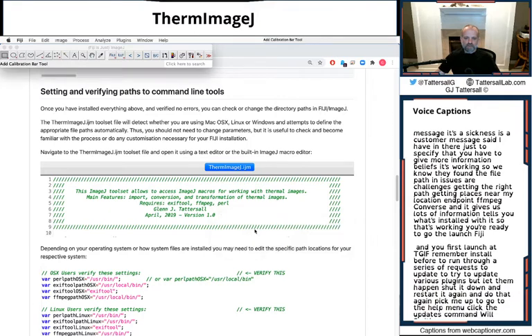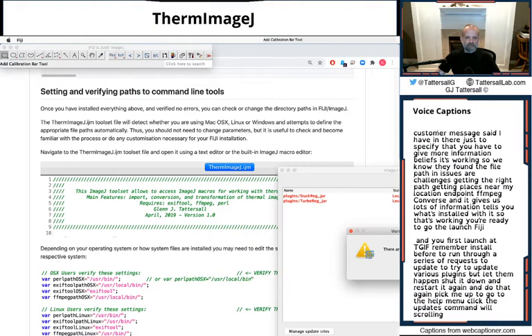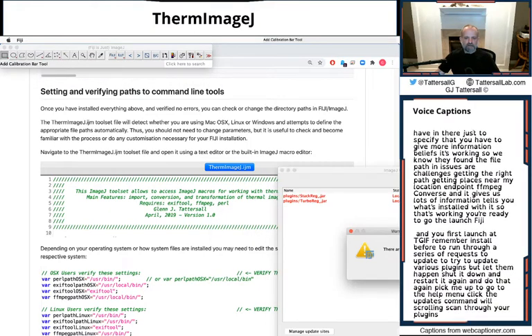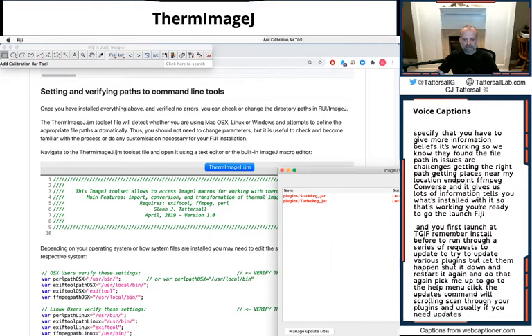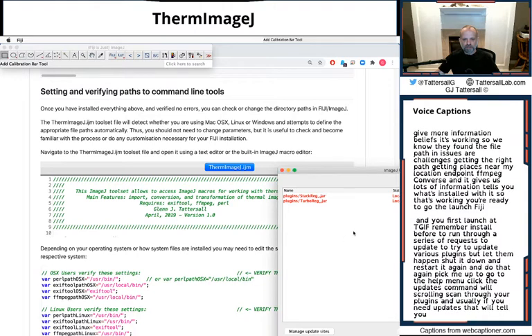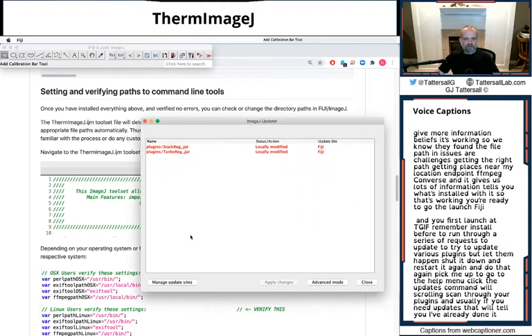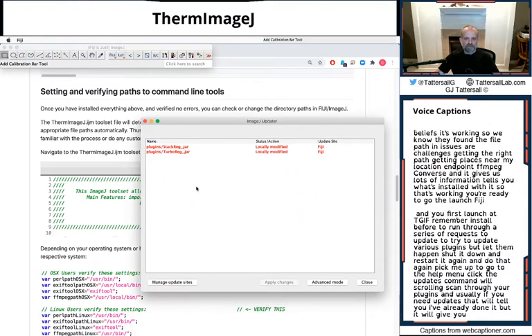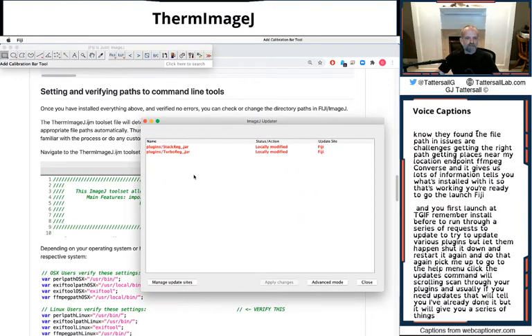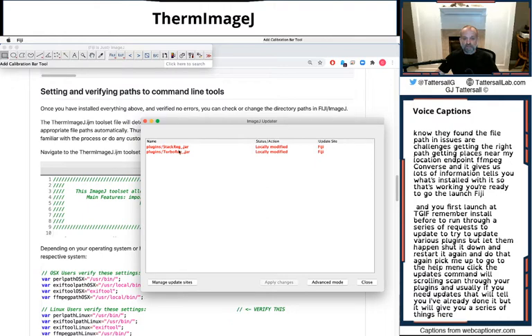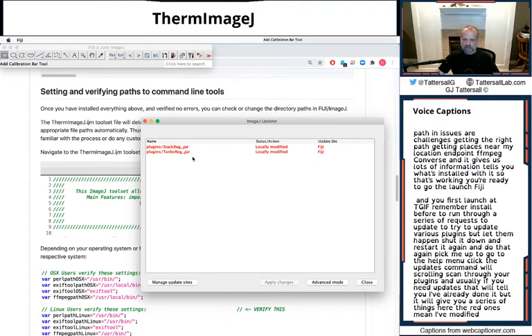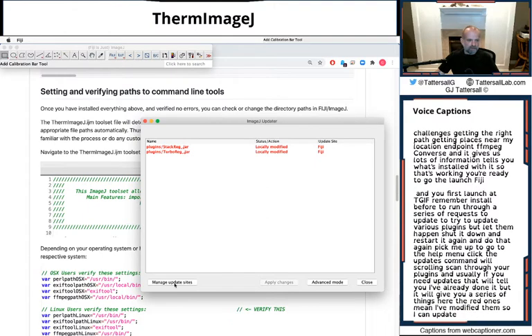It will scroll and scan through your plugins. And usually if you need updates, it will tell you. I've already done it. But it will give you a series of things here. The red ones - I've modified them so I can't update them somehow.